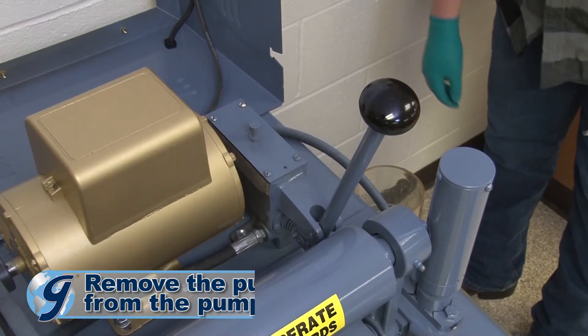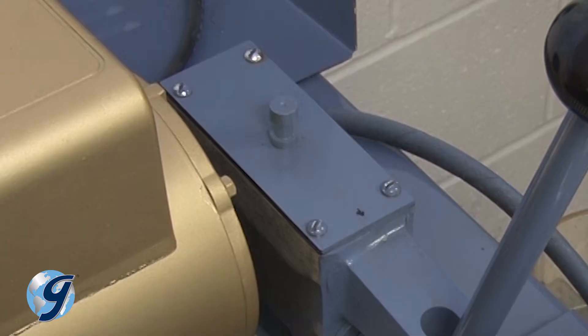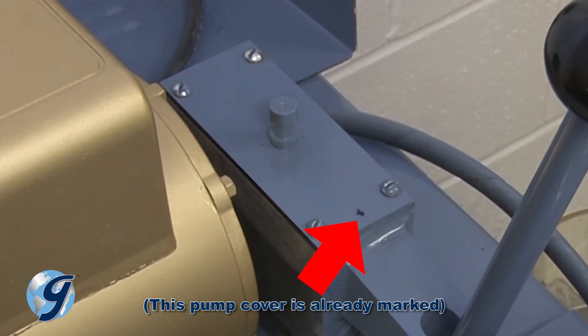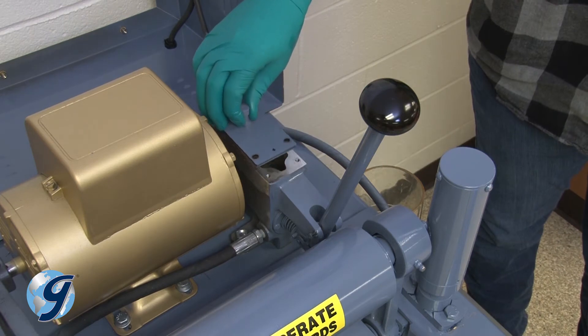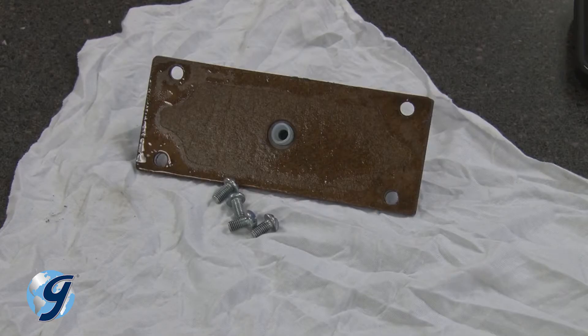Now, we're going to take the pump cover off the pump. Observe the hydraulic pump and the position of the pump cover. The pump cover is slightly offset closer to the front end of the pump near the pump handle. Use a marker or other means to mark the front end of the cover to ensure correct orientation during reassembly later. Remove the pump cover assembly including cover, gasket and screws, and safely set them aside to a clean area.